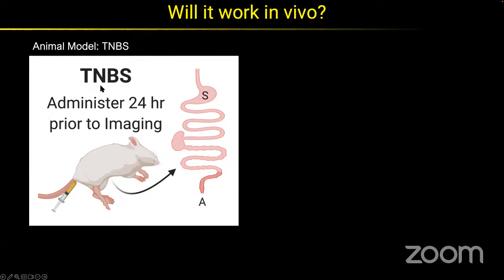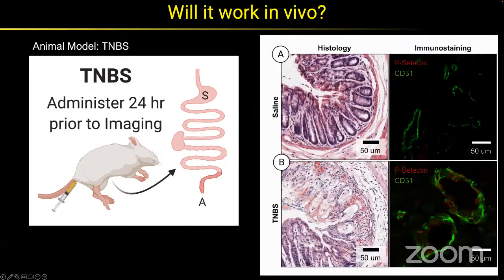That 50% ethanol permeabilizes the epithelial layer surrounding the gut lumen and allows these haptenized antigens to pass through and cause a T cell mediated inflammatory immune response. It works really quick. We get an inflammatory response within 24 hours. It's repeatable and nice and easy. My students love it because it doesn't take weeks and weeks to initiate.